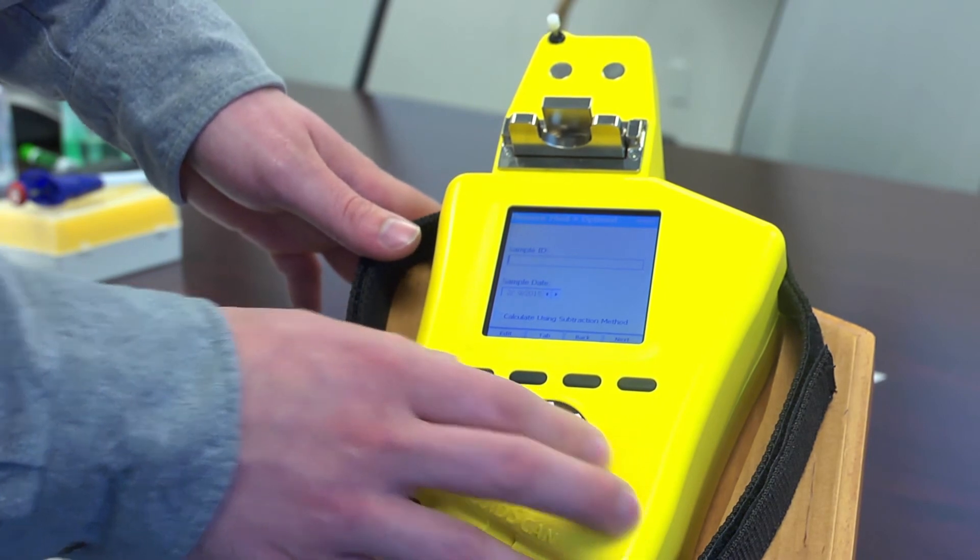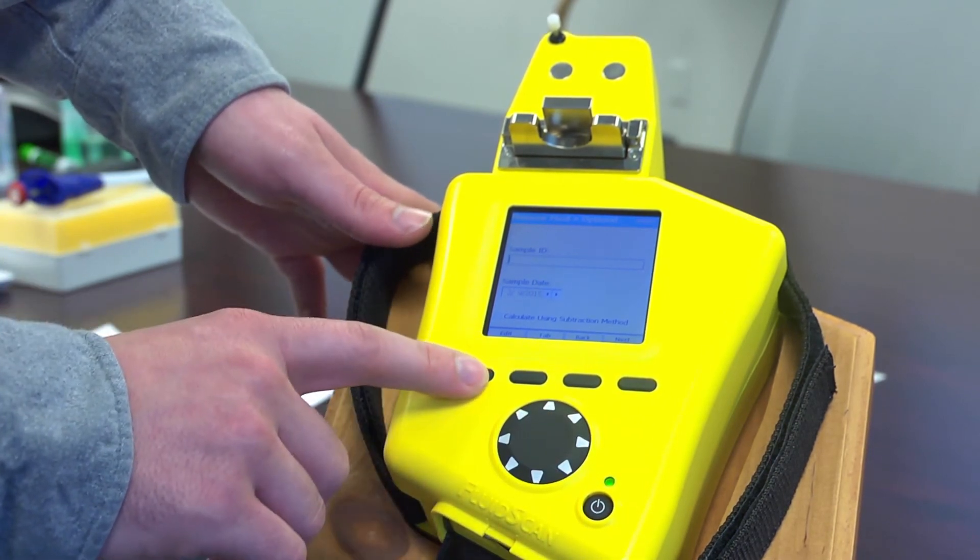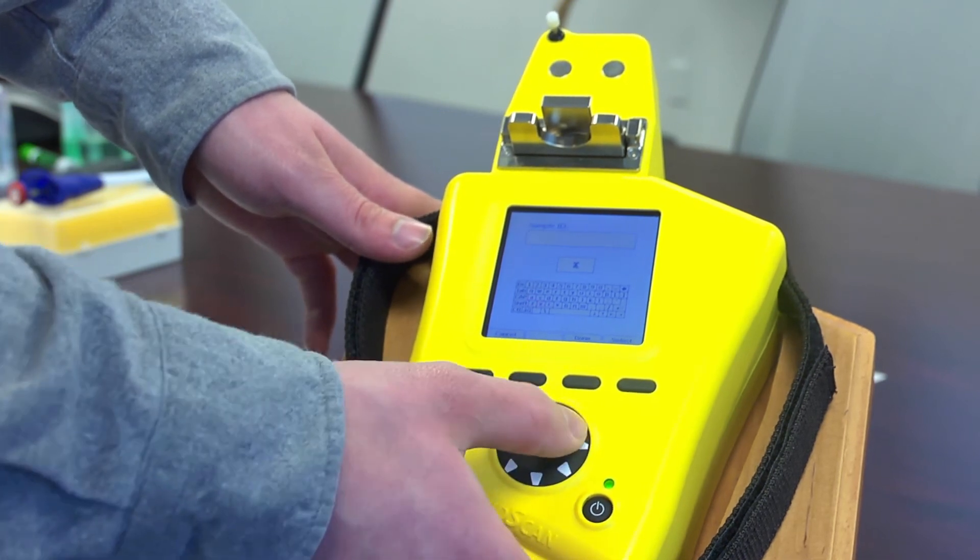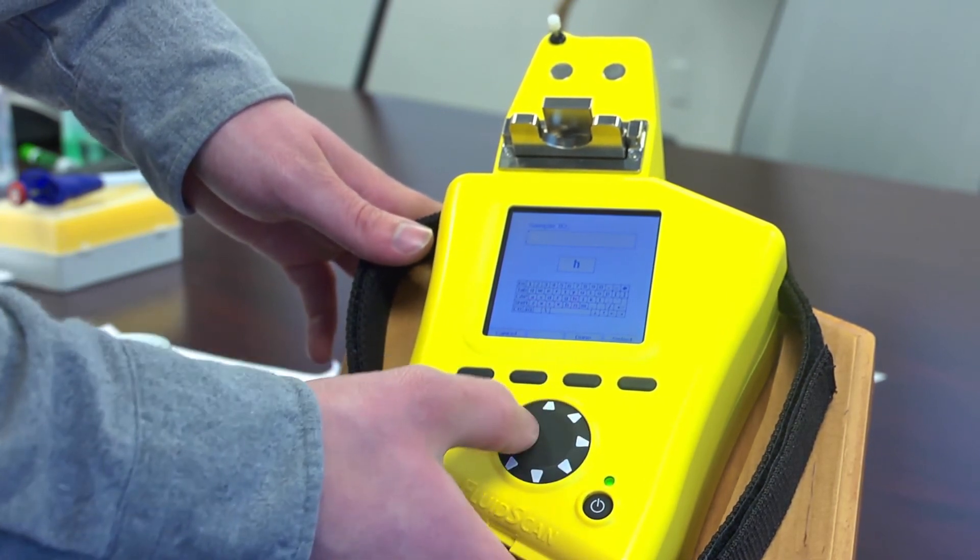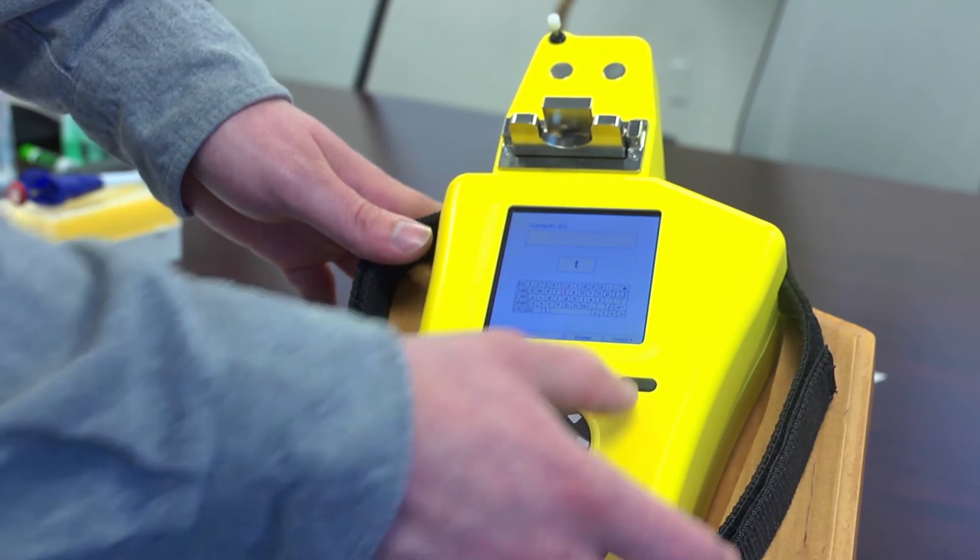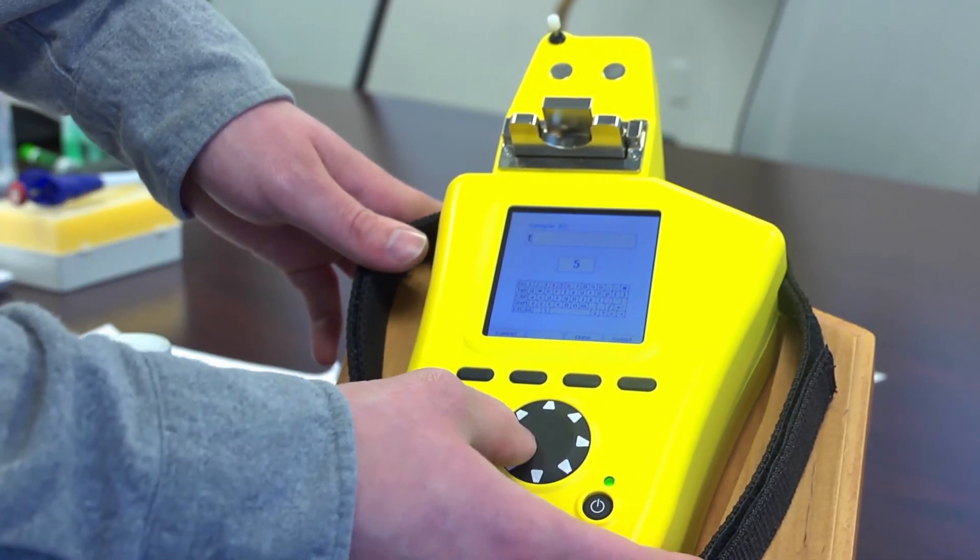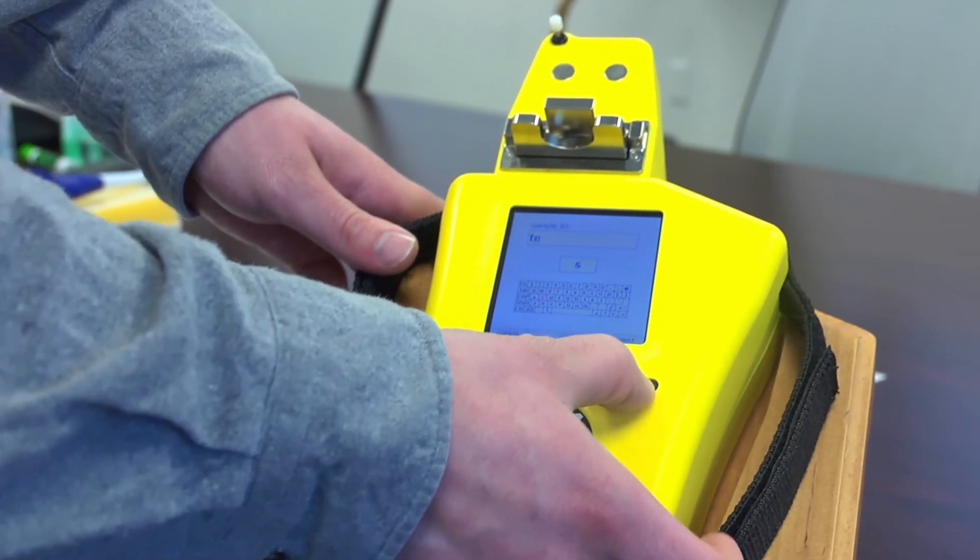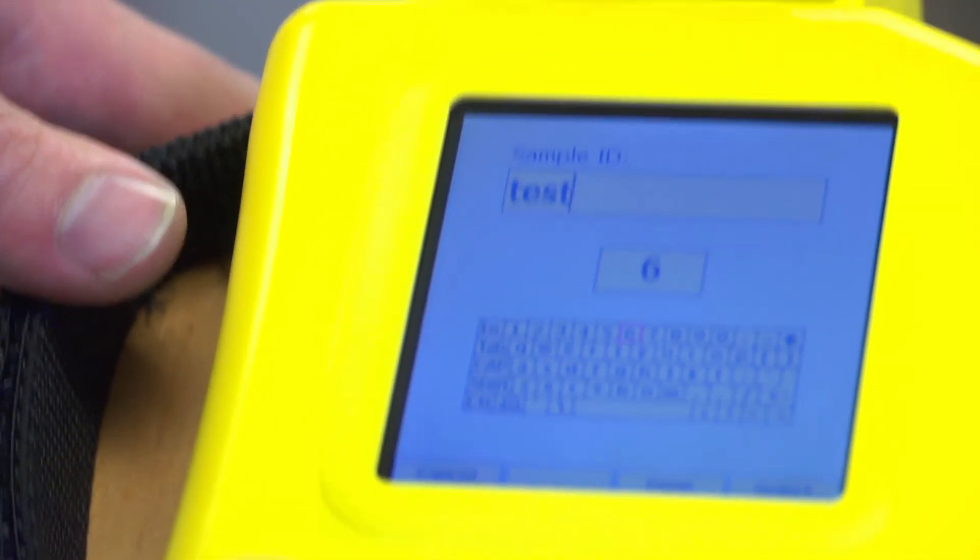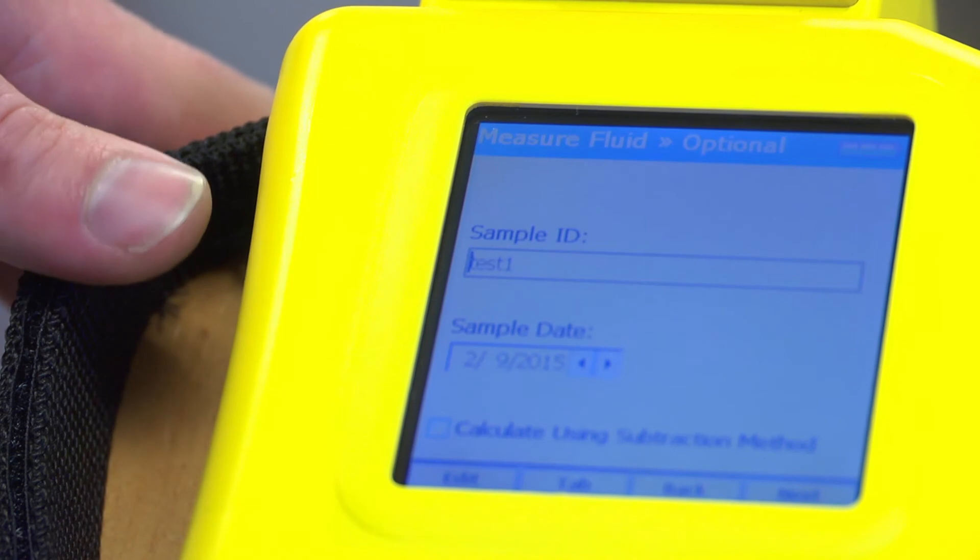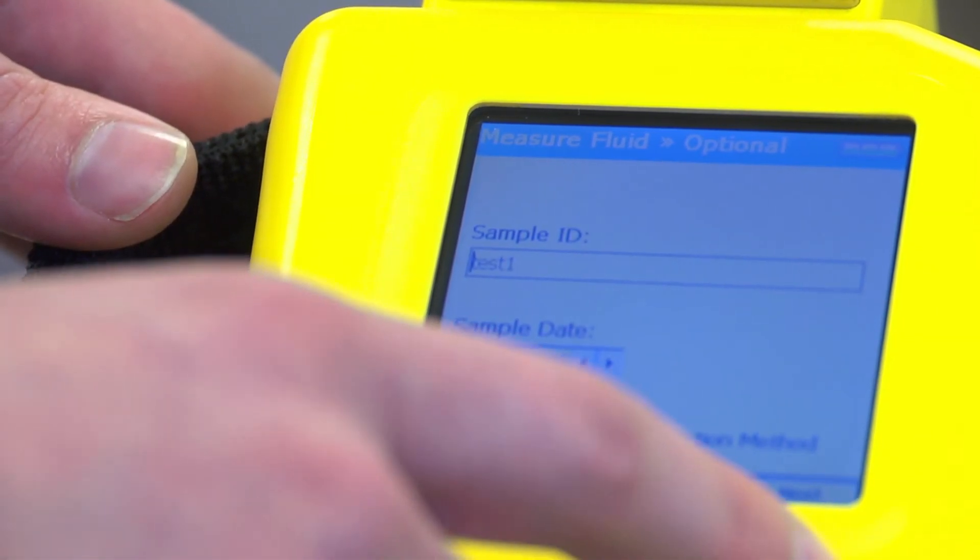You have the option of putting in sample ID by hitting the edit button and then using the push keys to move to select exactly what you want to put in, which today we say test 1. Then we hit next.